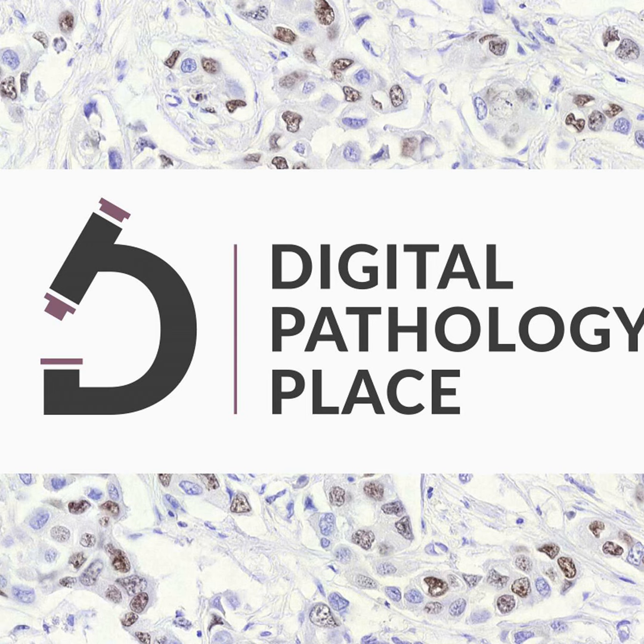Everybody has a smartphone. If you have a microscope and you're using it, take images and consult. But I think it's being downplayed in the era of personalized medicine and AI giving you insights you were not able to see in the slide, which is a fantastic technology.